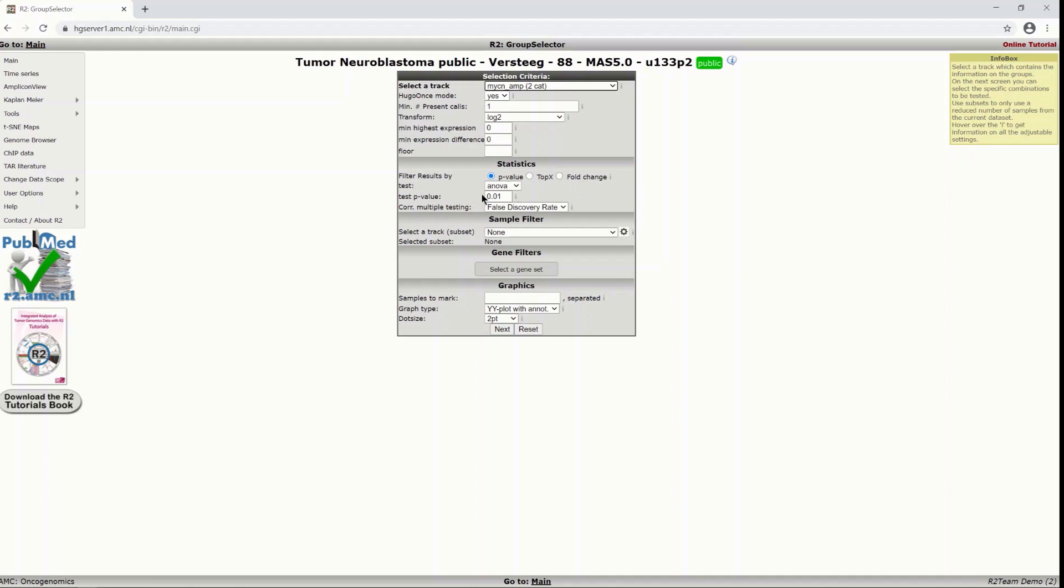Also you can see that we are using a correction for multiple testing which is done with the false discovery rate but other options are available as well.